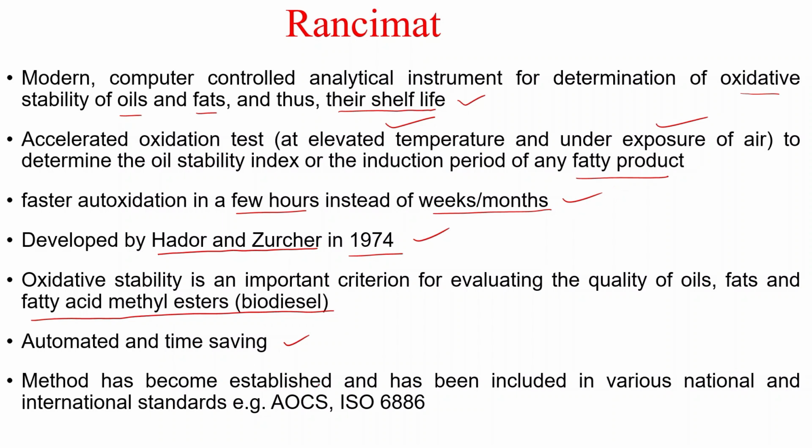Now the method has been established and has been included in various national and international standards. So AOCS, ISO also have included this method for determining the oil stability index or the induction period or the shelf life of any fat containing product, adopted by the international organizations also.